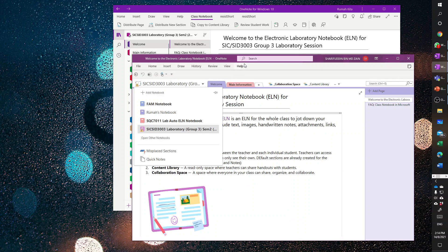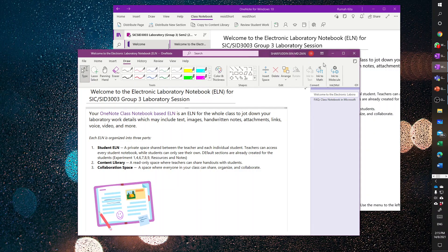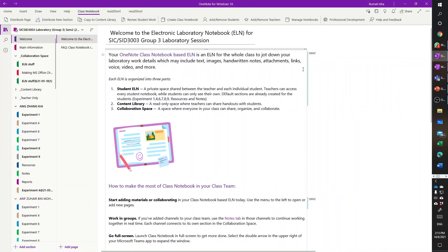You don't have to worry about which version you use, but if you need to draw molecules and have them converted to real molecular structures and saved in SDF format, then you would want to use OneNote for Microsoft Office, which has the add-in called 'Ink to Molecule.' You can draw the molecule and get it converted to a proper molecular structure. Of course, this is an add-in, so you have to install it in order to use this ink-to-molecule feature.